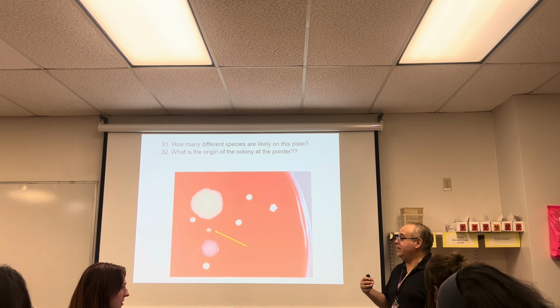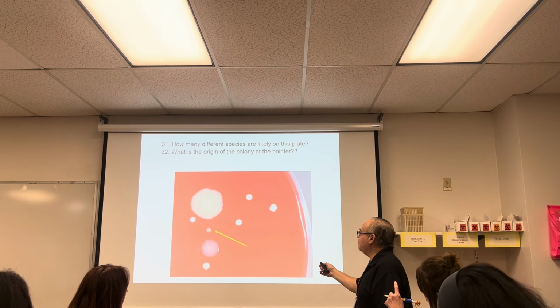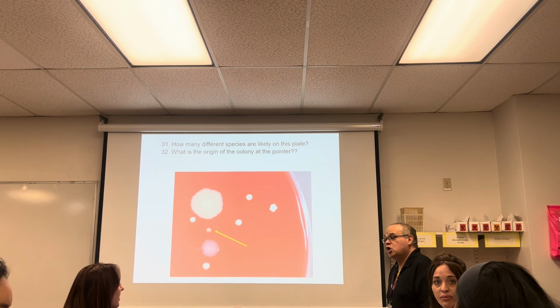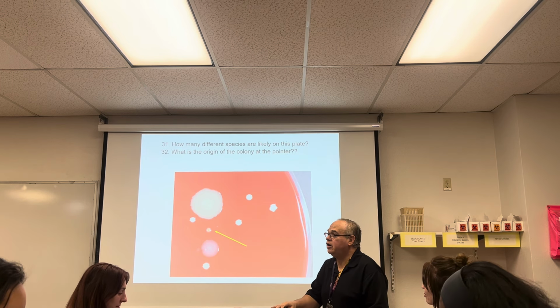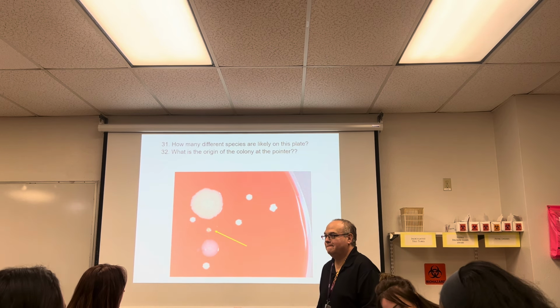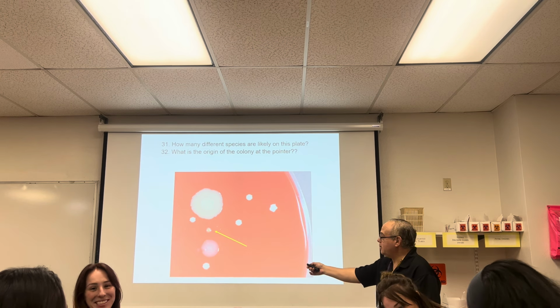However, I said how many species. So this one, and that one, and that one, and that one, and that one are the same. That's 1, that's 2, that's 3, that's 4, and that makes 5. So if the organism's colonies are similar, they're the same. If they're different, they're different species. Okay? Good? What's the last one you're pointing at? This little tiny dude right there.